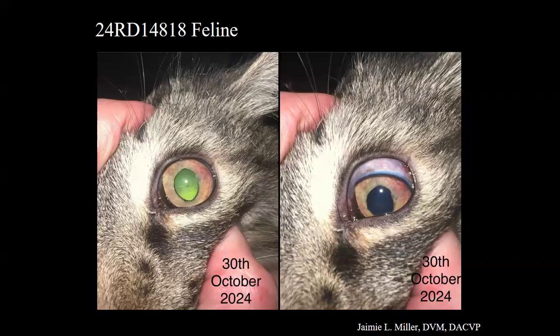So we submitted the tissues. Sorry, there's a lot of construction noise going on. We submitted the tissues in origami. So you take some like lens paper, square lens paper, and fold up the tissues.